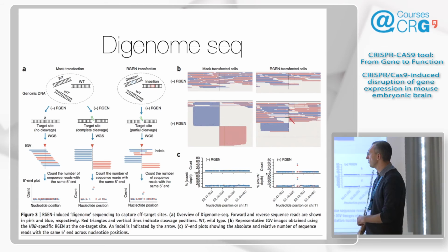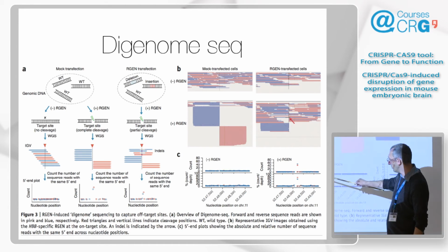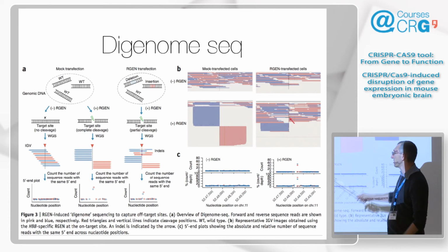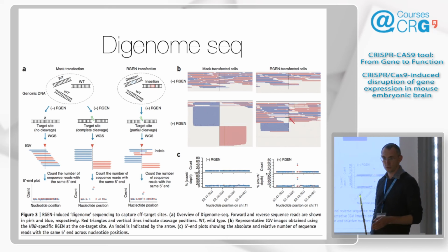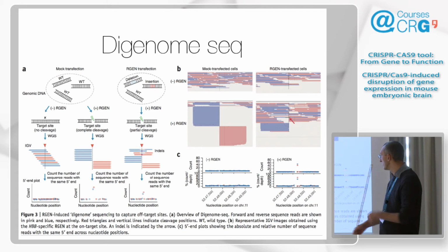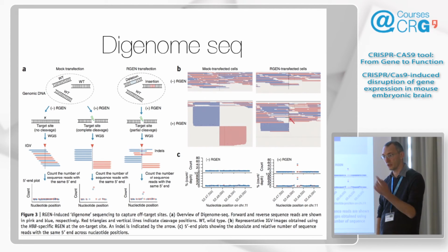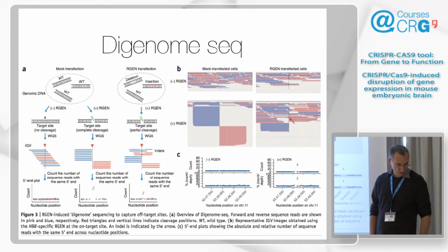Now what happens if you have an edit? This is what happens. You get reads around these positions that are identified by the cut of the wild type, and then there are some edits there, and these are also easy to computationally identify. They provide all the tools, so you don't have to develop everything from the beginning, and the assay is very easy to do. And it's currently the most sensitive. With this assay, they identified what I talked about previously, the 2Gs at the beginning help. All right, so with this, I covered the general part about the mouse.